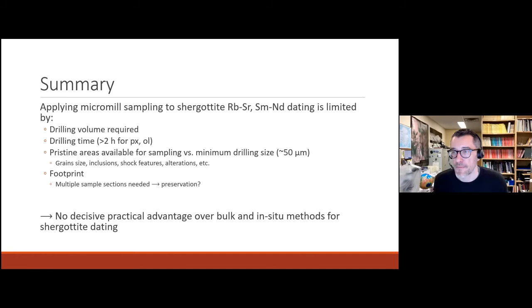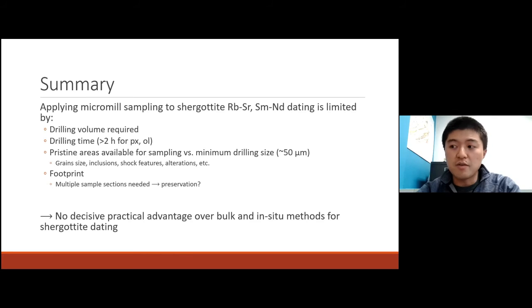Thanks. A question, I think, for those who are more familiar with mass spectrometry. Are there any prospects for reducing the minimum amount of strontium and neodymium that you would need in order to resolve the isotopic composition below what Alex has estimated here? Any comments on that? That's definitely one of the questions I've been considering as well.